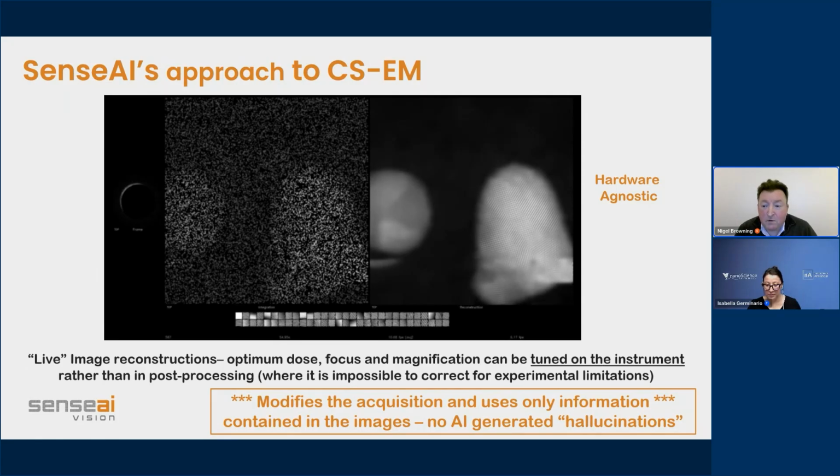And again, if you're interested and you want more information on that, happy to send you the papers, happy to do this offline with more of the mathematical details. But essentially, the way that you fit the dictionary to the image, you know how many dictionary elements need to make a good fit, and you also have an error metric of how well that fits.